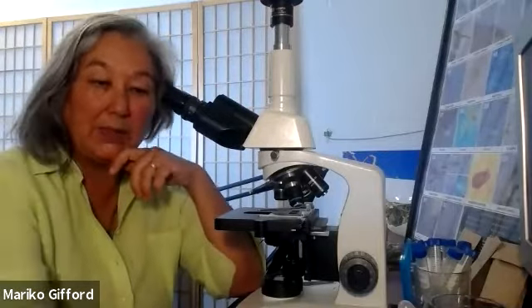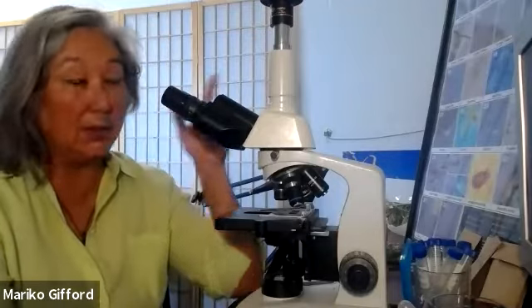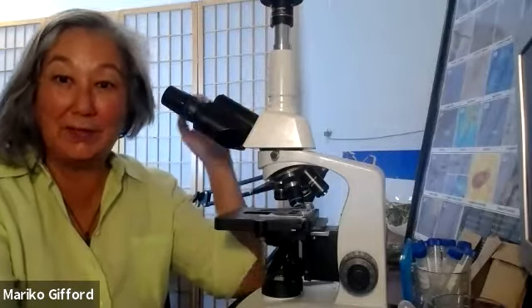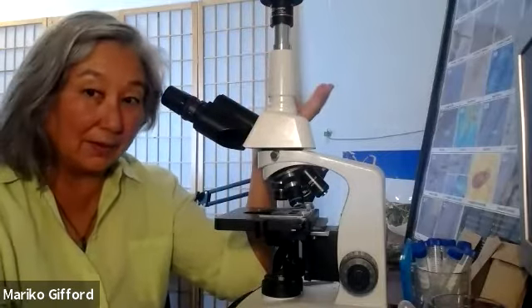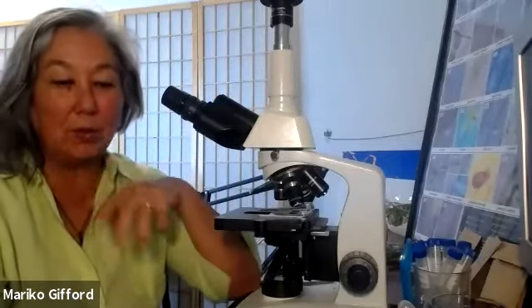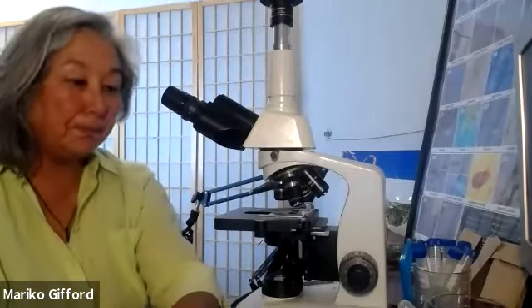But when I was sending samples to Dr. Ingham to see this is what is in my compost, she sees that picture, and if there's some question I have, I can be online with her and she can be looking at that. So that's just if you know, for a classroom situation, or if you're really in the study of it.